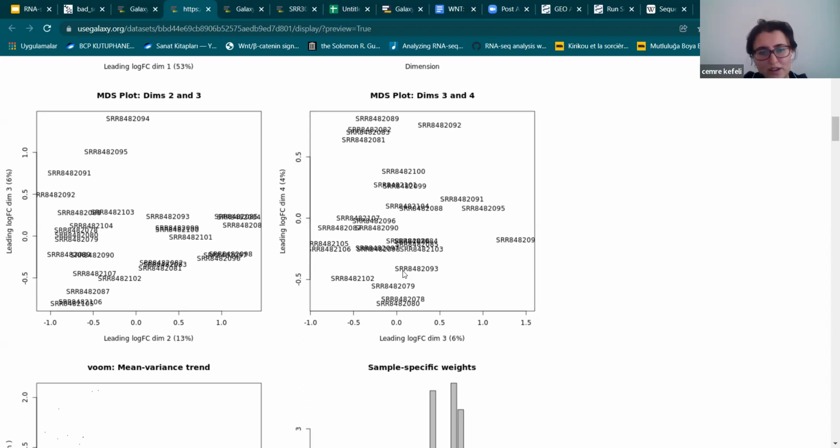So I'm showing what I have in hand. When you say some time, are you speaking of 5 minutes, 1 hour, 1 day? Uploading and extracting the data takes maybe 30 minutes or 1 hour. It depends; if it's like 16 gigabytes, it may take maybe 2 hours. I don't know.